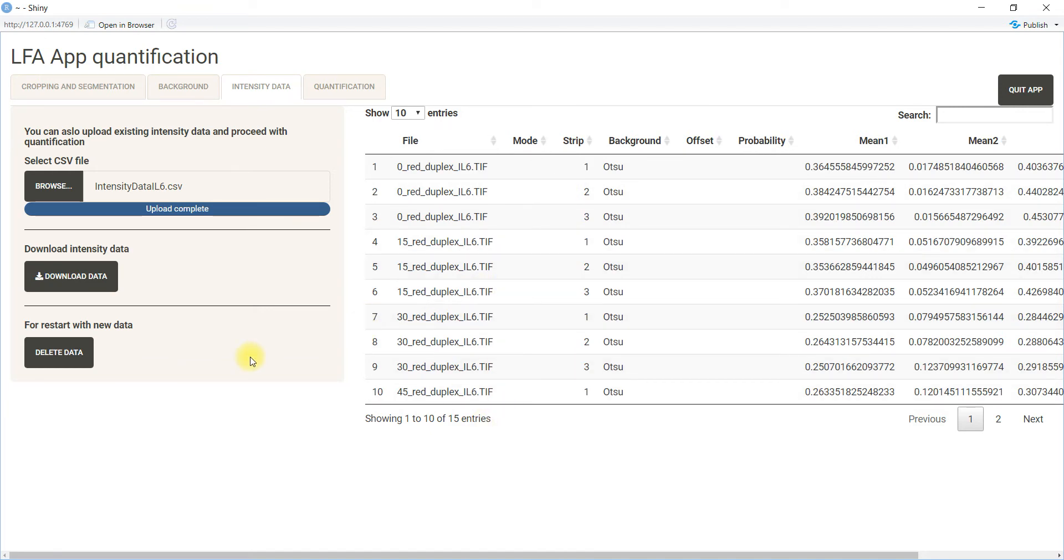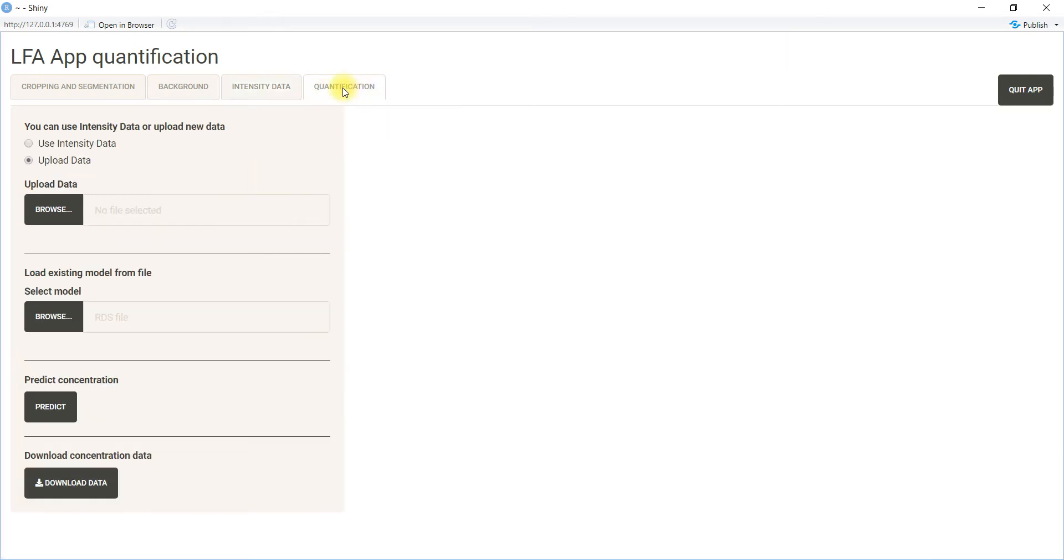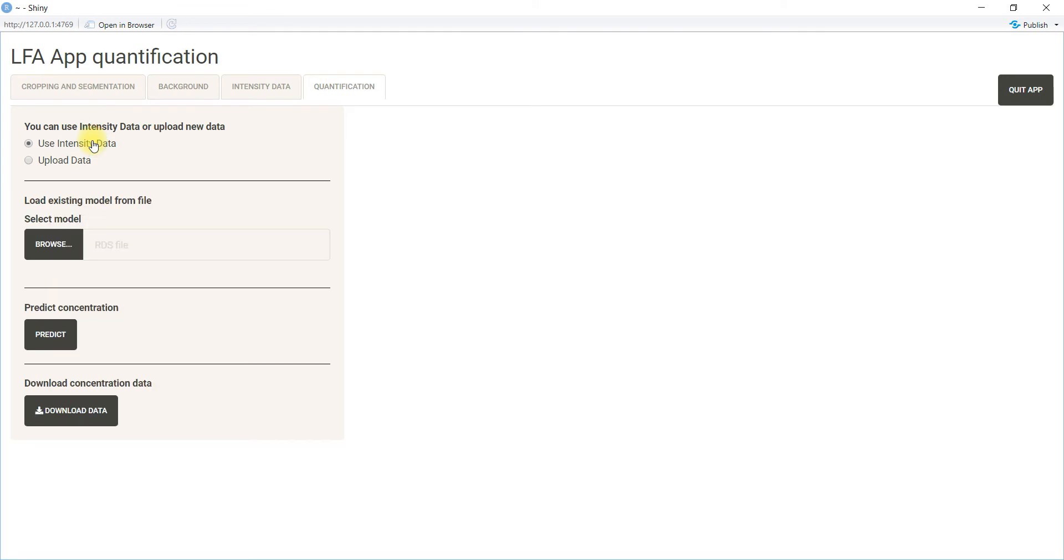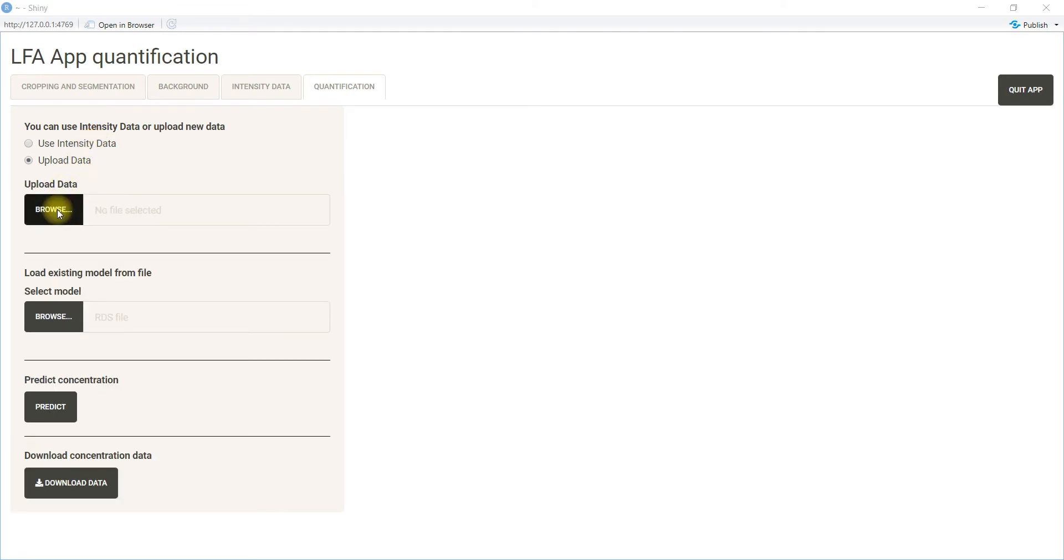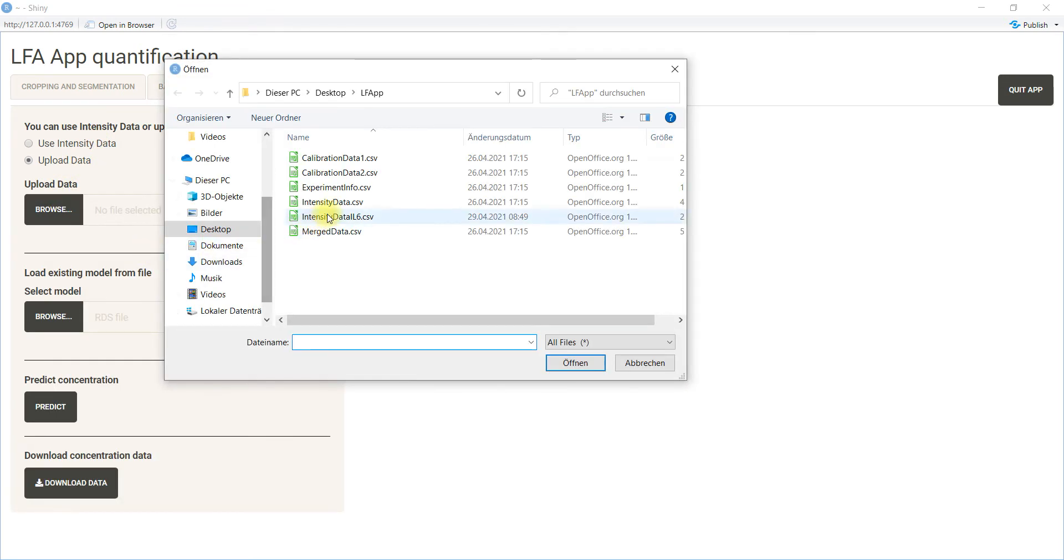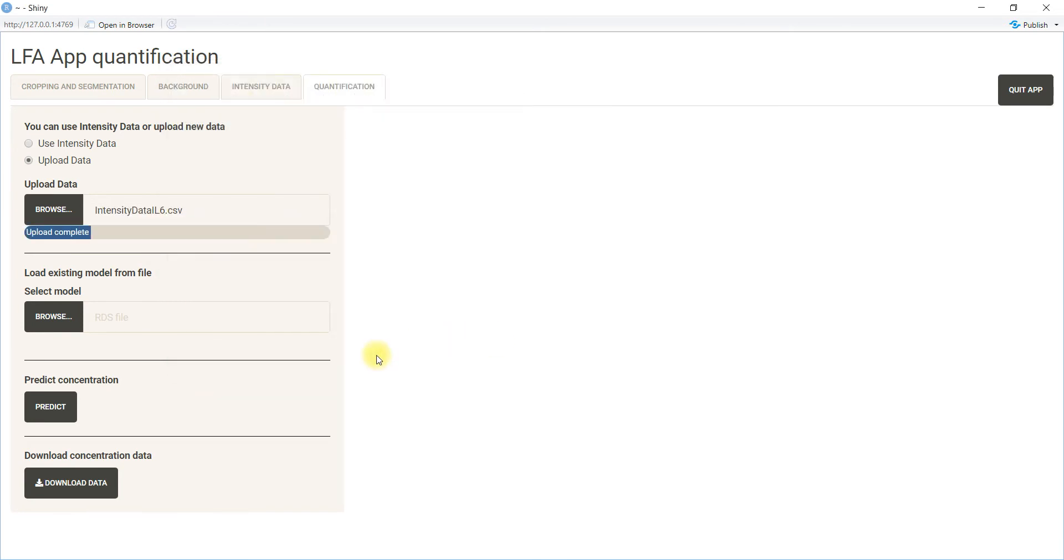Next is to go to the quantification tab. Here you can also upload data or use intensity data you have generated. I will upload intensity data again. Now this intensity data is not visible yet.